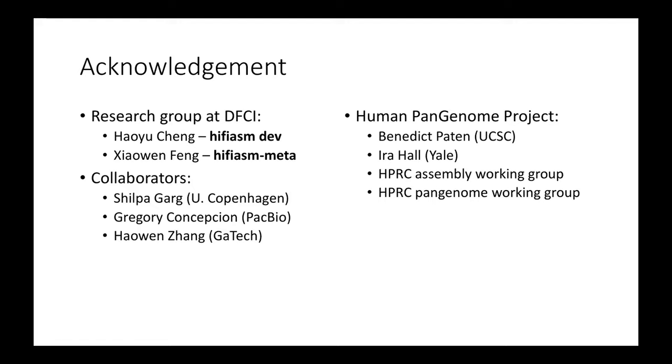Hi-C or Omni-C, they are about the same. I mean, these two data types are about the same. I think with trio, so far we still get better assembly. Hi-C assembly is quite challenging. Although I think we get the best results so far, if you have trio it will still do slightly better than Hi-C. So if you have the budget for it, trio data is the... Yeah, and also, you need the trio sample. Sometimes it's difficult to obtain the parents.